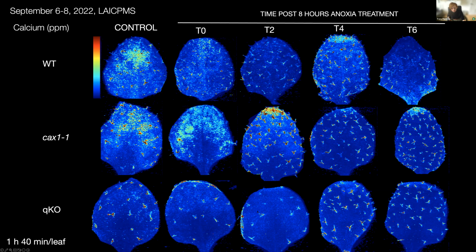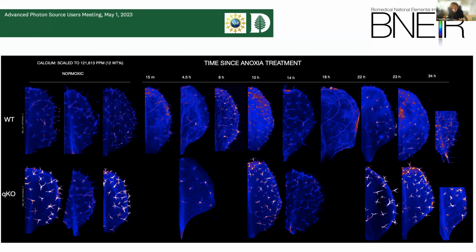The interesting thing that we're seeing down here in the mutant is nothing moves. The calcium that we see enriching these leaf hairs never gets out. And that seems reasonable because we've taken away all of the CAX transporters that it would ordinarily use to mobilize calcium out and send that signal that it's under abiotic stress. So we still have some quite tantalizing results.